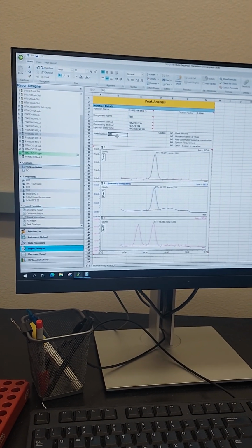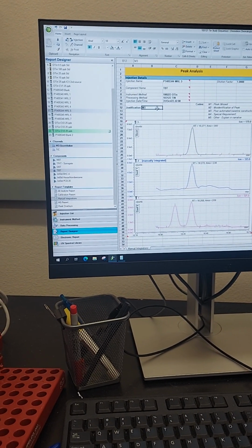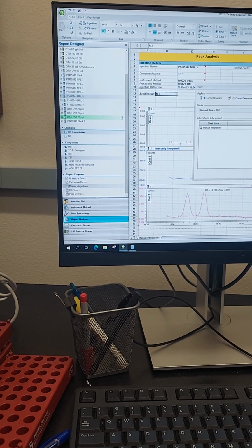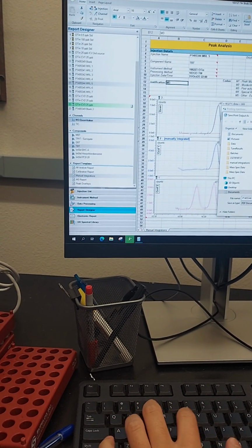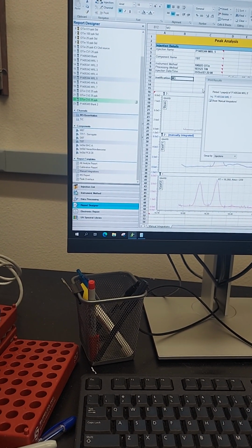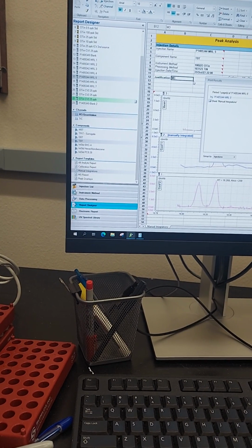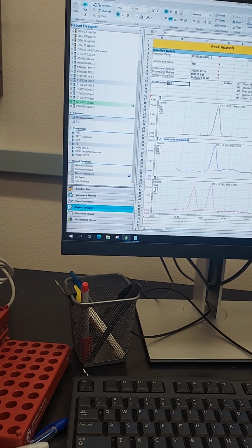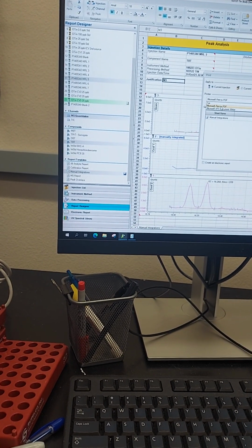And then just leave all this the same. Okay. Then go front and save as PDF. Or you did print and then I did print to PDF. And it goes to somewhere, a file folder. Let's see. So I did print, print, and then it says I select print to PDF.